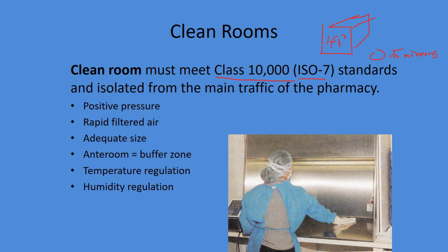And of course, we want positive air pressure. So you're going to put your hood inside your clean room. And if you open the door to your hood, you want clean air to rush out. Hence positive pressure. Unlike the biological safety cabinet, you wanted negative air pressure. You wanted the chemotherapy to be sucked in and stay inside the cabinet.